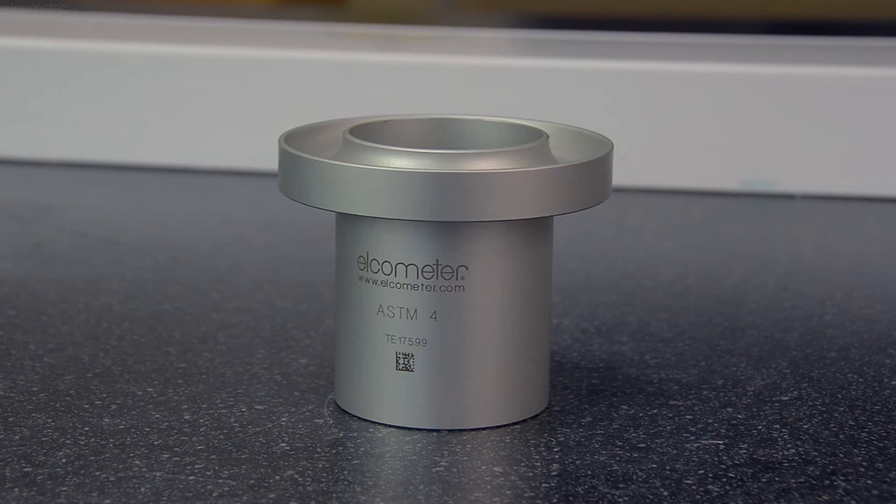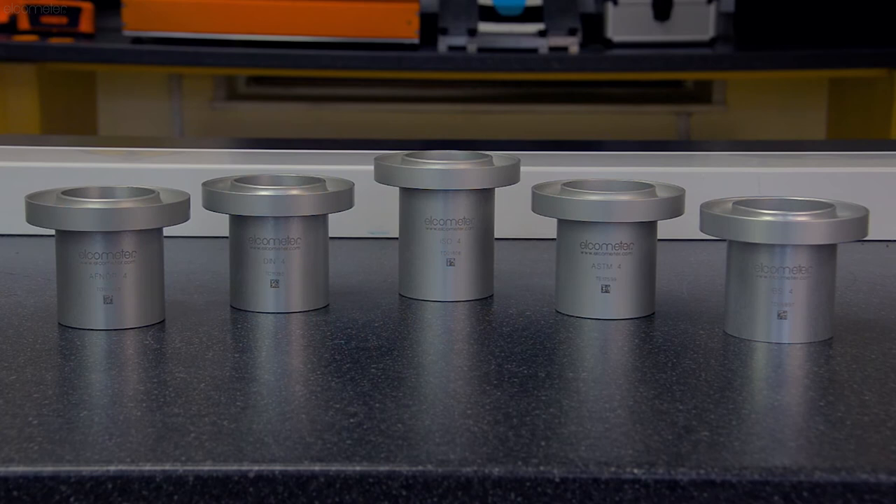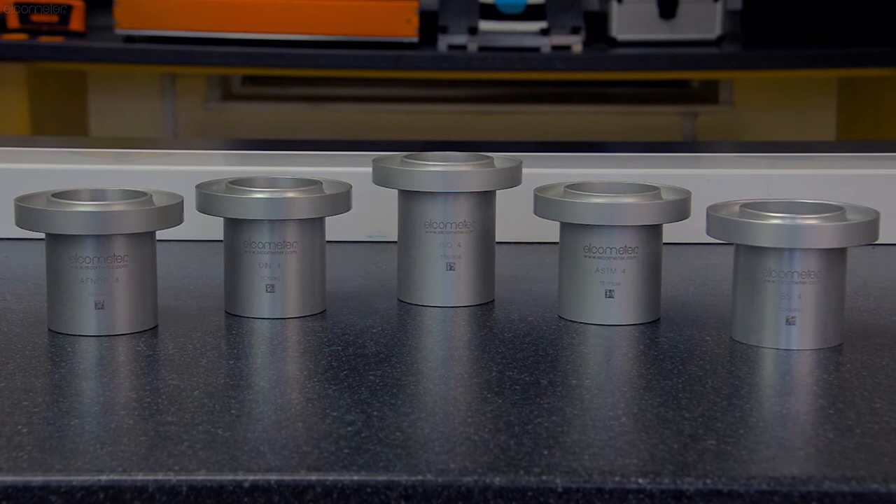A flow cup is a cup of specified size and volume, with an overflow channel at the top and a hole of a defined size in the bottom. They're available in a range of designs in accordance with national and international standards, with various orifice diameters to suit different viscosities.